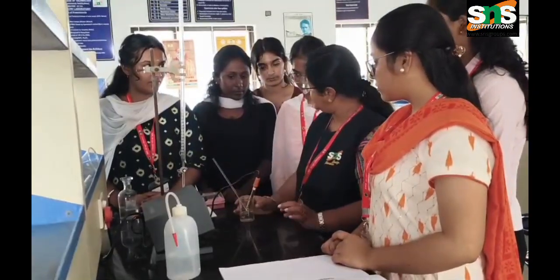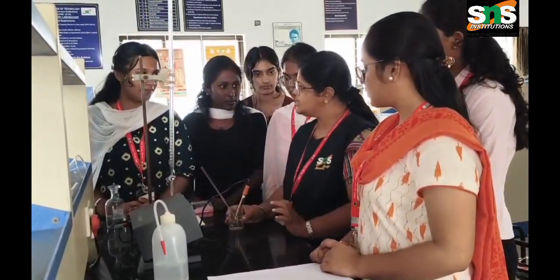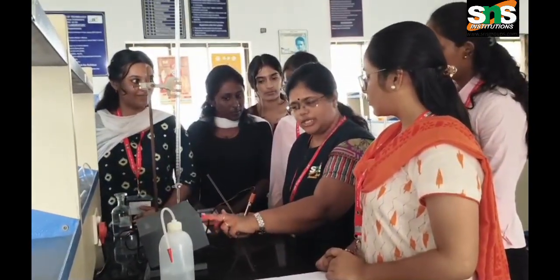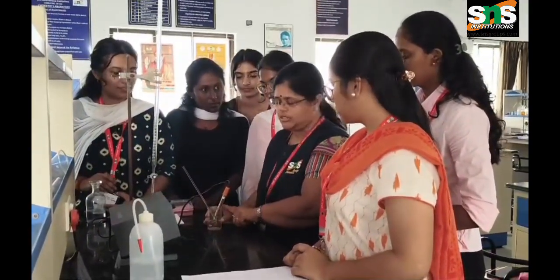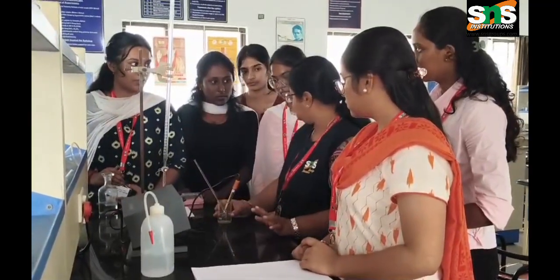Why do we get a value? Because of the movement of H plus ions in this solution, the conductivity cell gives you the value.